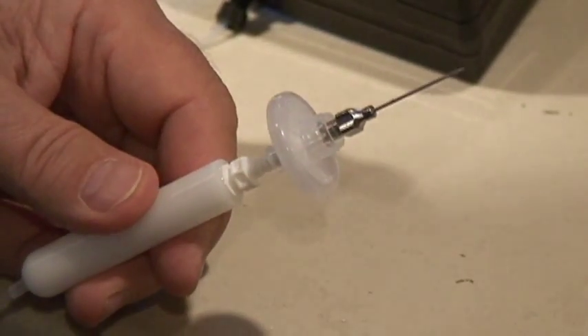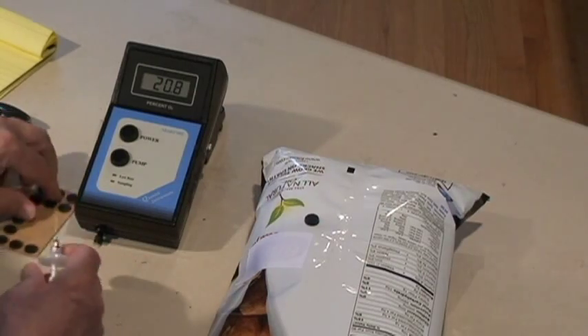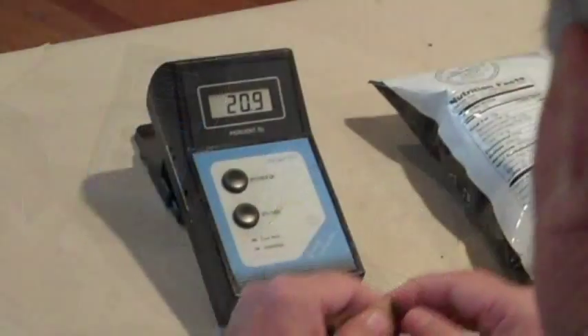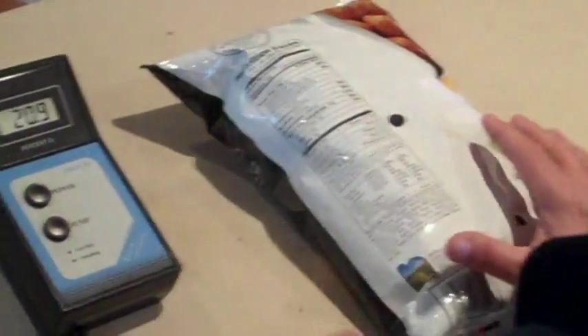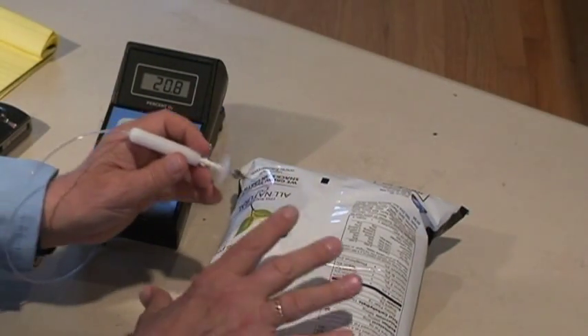Then onto the filter we insert a needle. Now onto the package we put an adhesive-backed foam sticky. This will be our puncture point that will provide a good seal around the puncture so air doesn't leak in.